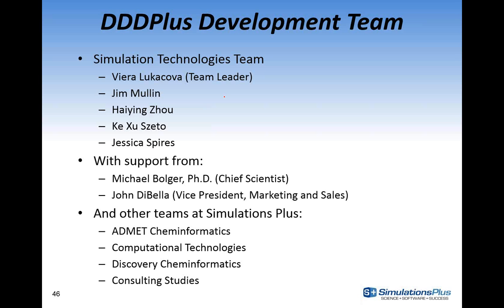Yeah, so currently most of this is focused on crystalline drug products. And I think this is an undertaking for GastroPlus too, looking at more amorphous solubilities and the difference between the amorphous solubility and the crystalline solubility, and looking at those dissolution rates separately, and the precipitation rate. It's currently not specifically built into our models.